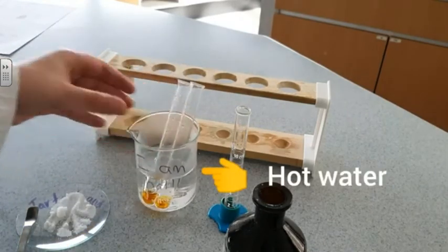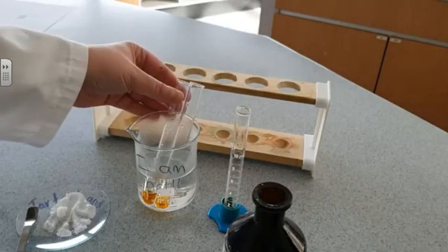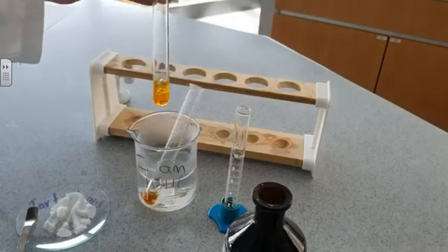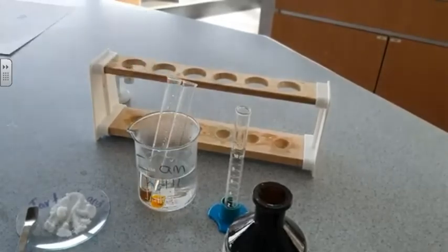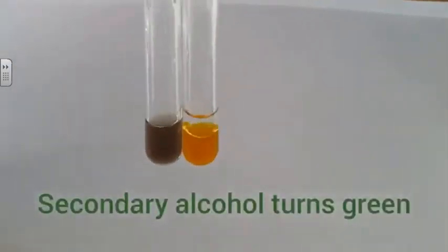And again we're putting them in a hot water bath to warm the chemicals. And we can see that in the secondary alcohol group oxidation occurred.